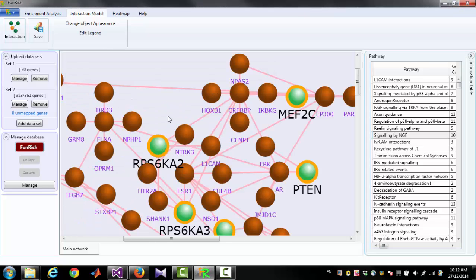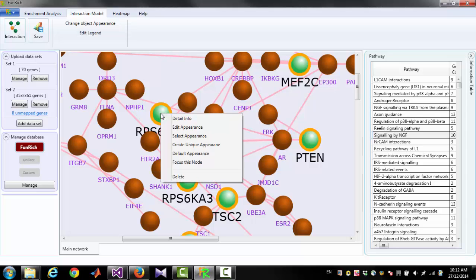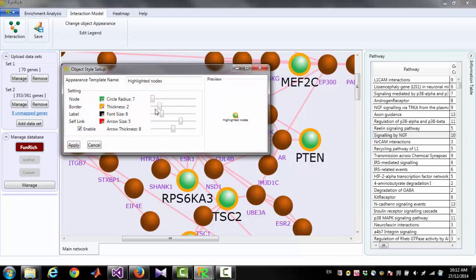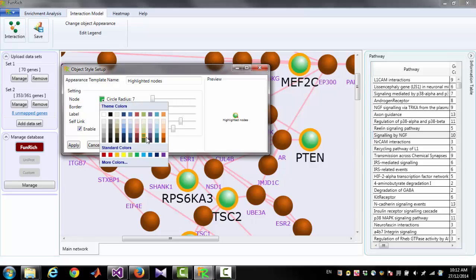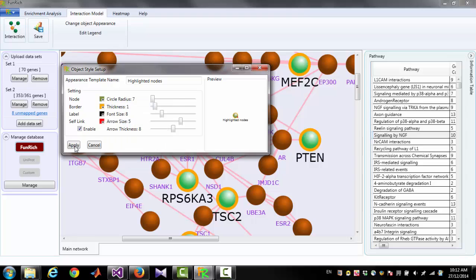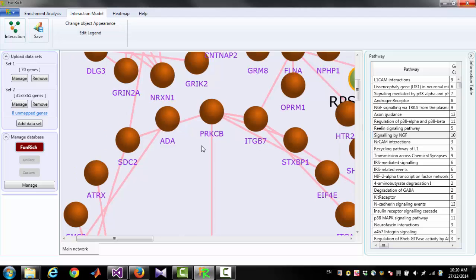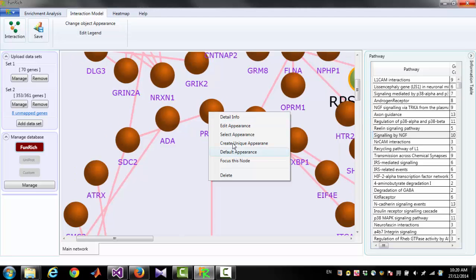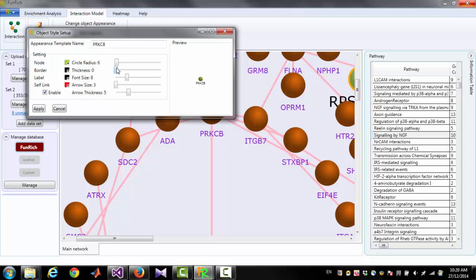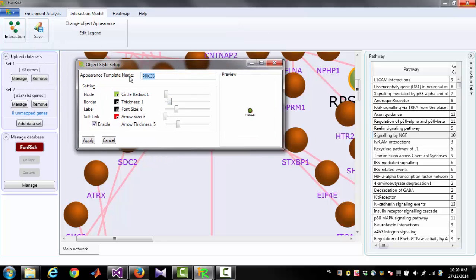Similarly, if you want to change the appearance of all highlighted nodes, select any one highlighted node and change the color and size. If you want to create a unique appearance, right-click on the node and click 'Create Unique Appearance'. Now you can give a particular color and size to that node and also give a name to that appearance model — for example, 'My Model'.